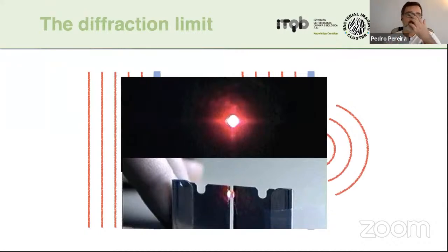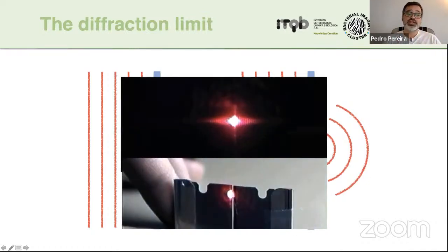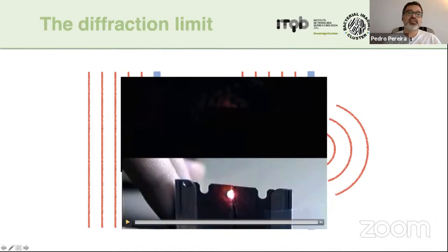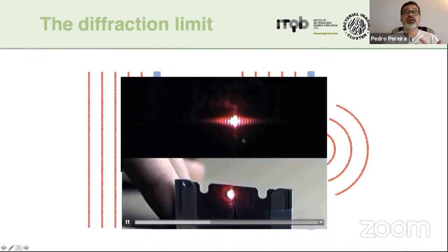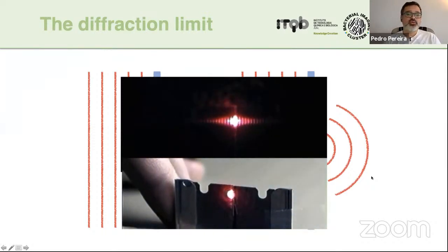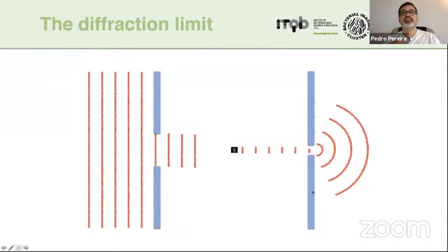And one might imagine that when you close them, the laser, so this is the laser on a wall behind, would just get smaller because you're closing it. But in reality, that's not what you see. What you see is not only that it doesn't get smaller, but it gets bigger. And you start seeing the interference patterns that you heard about Tuesday that characterize the PSF, okay?